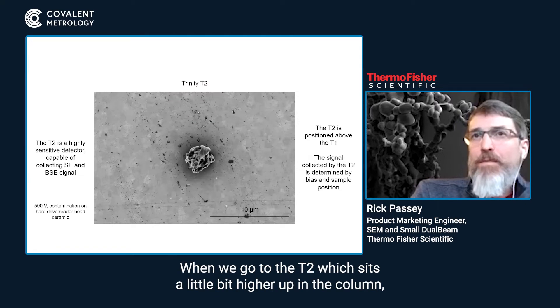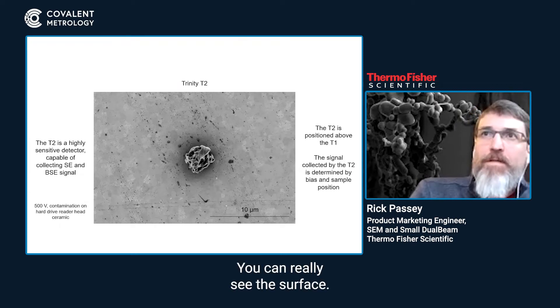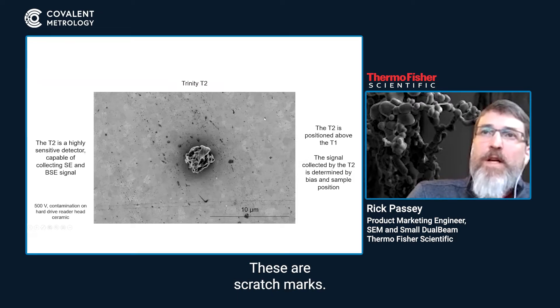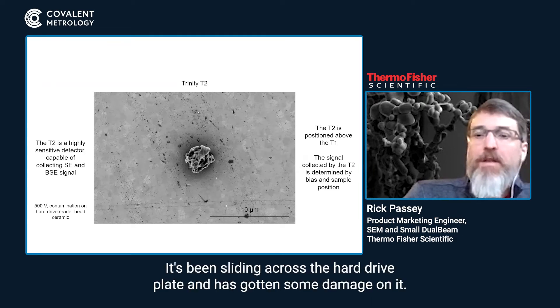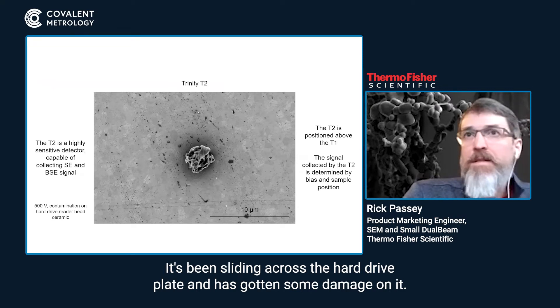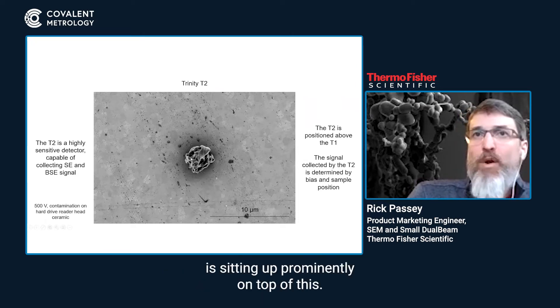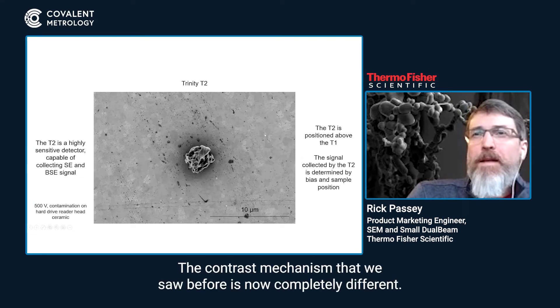When we go to the T2, which sits a little bit higher up in the column, you get a totally different view of the sample. You can really see the surface, and specifically, if you pay attention to the lines going across the sample, these are scratch marks — wear patterns from a hard drive head that's been used, sliding across the hard drive plate and sustaining damage. It's also picked up some contamination, and now you can really see this particle sitting up prominently on top. This stuff is a little lower profile, and the contrast mechanism is now completely different.